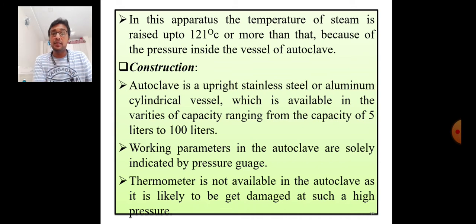हा एक क्वेश्चन आहे, परत इम्पॉर्टंट क्वेश्चन जे तुम्हाला वायवामध्ये विचारला जाऊ शकतो, ॲज अन अ गुगली अँड ॲज अन अ ट्रिकी क्वेश्चन. हा क्वेश्चन तुम्हाला एक्झामिनर बऱ्याच वेळा विचारतात की आपण ऑटोक्लेव्हमध्ये थर्मामीटर वापरतो का, तर तेव्हा कधीच हो म्हणायचं नाही. Thermometer is not used in the autoclave.